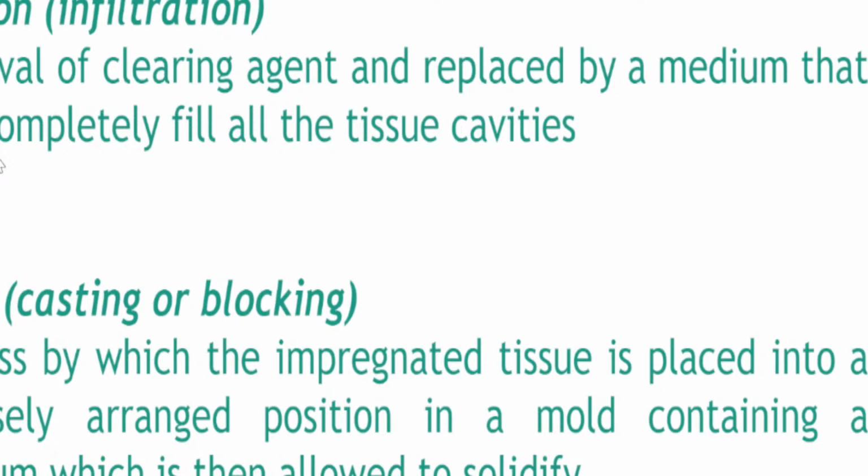Hindi yung basta tayo kukuha ng appendix, ganyan ko lang yan dyan. Mostly ang gusto ng mga pathologist makita is yung lumen ng appendix. Kapag ang pinakita mo yung balat sa labas lang, yung outer layer lang ng intestine ang nakita ng pathologist, 'di ba? So that's why it's important that medtechs themselves are taught gross sectioning, a gross analysis.